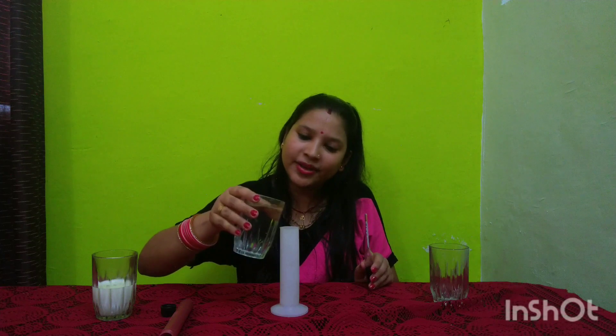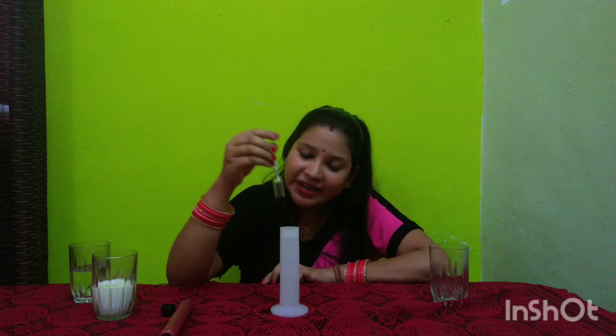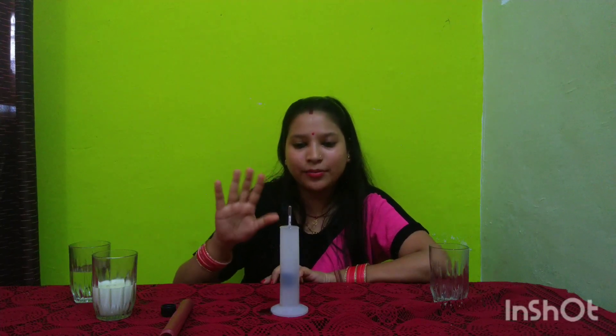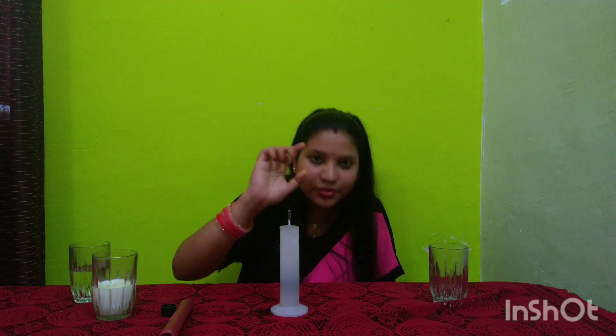First, I will fill the jar with water and dip the lactometer in it. We have to let it stabilize. As you can see, when it becomes stable in pure water, the reading is around 0. So for pure water, the lactometer reading is approximately 0.